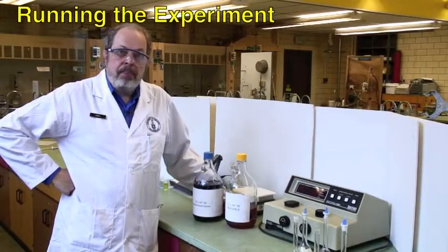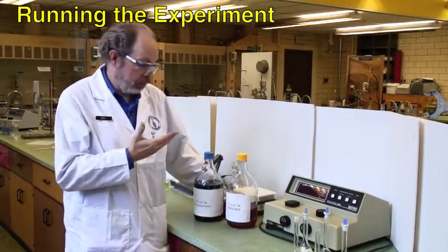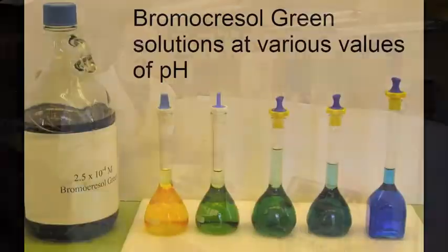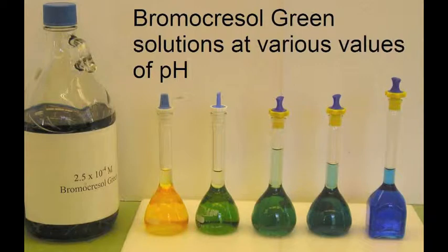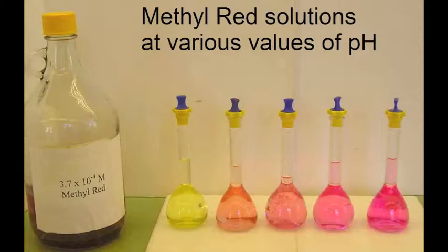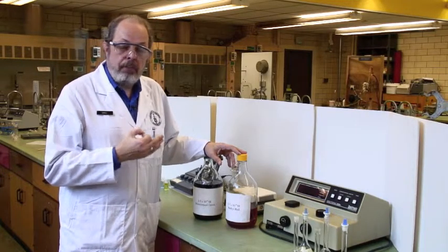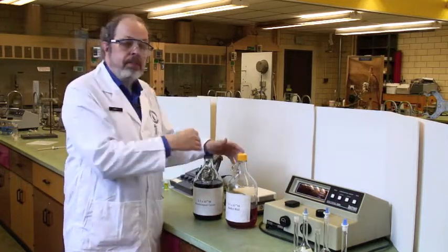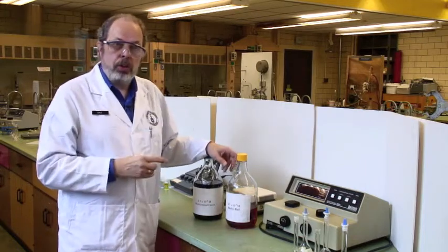You will be making up five solutions of whichever indicator is yours. Let's say you're doing bromocresol green. You will make them up at five different pHs. You'll get a blue solution, a yellow solution, and three different shades of green. For methyl red, you'll get a yellow solution, a pink solution, and three different shades of orange. You will need to run a spectrum of the blue and the yellow, or in this case of the yellow and the pink, as we showed on the board.